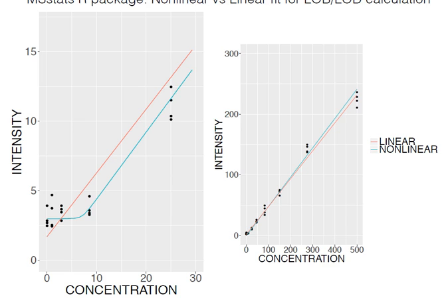Because I tested this method with maybe something like 2,500 peptides, and it was really great to debug the method, because there are a lot of peptides that are not great, but you still have to get a value for the LOB and LOD for those. So the repository online was very useful for that, and just to really cover all the different cases.